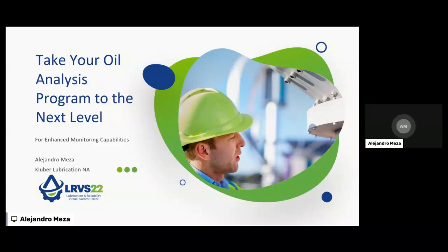We typically understand oil analysis as taking a sample of oil in a machine that is in operation, sending it periodically to the laboratory, getting the results, seeing the flags, if it's green, yellow, red, and making decisions upon that result. The fact is, this is a very useful, very valuable resource, the way it's used, but the purpose here with this presentation is expanding the vision.